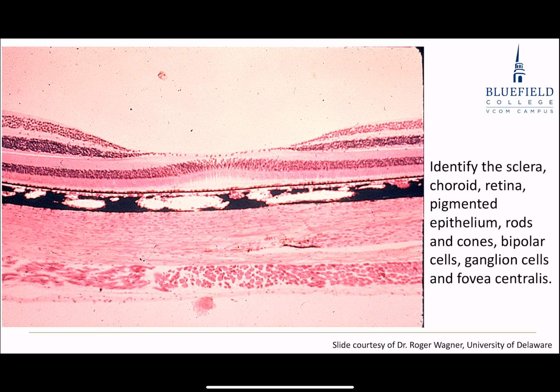That's why you have the best visual acuity. You also have the highest concentration of cones. You can see color there, the best, at that fovea centralis. Compare that to this image right here. I purposely put these back to back.